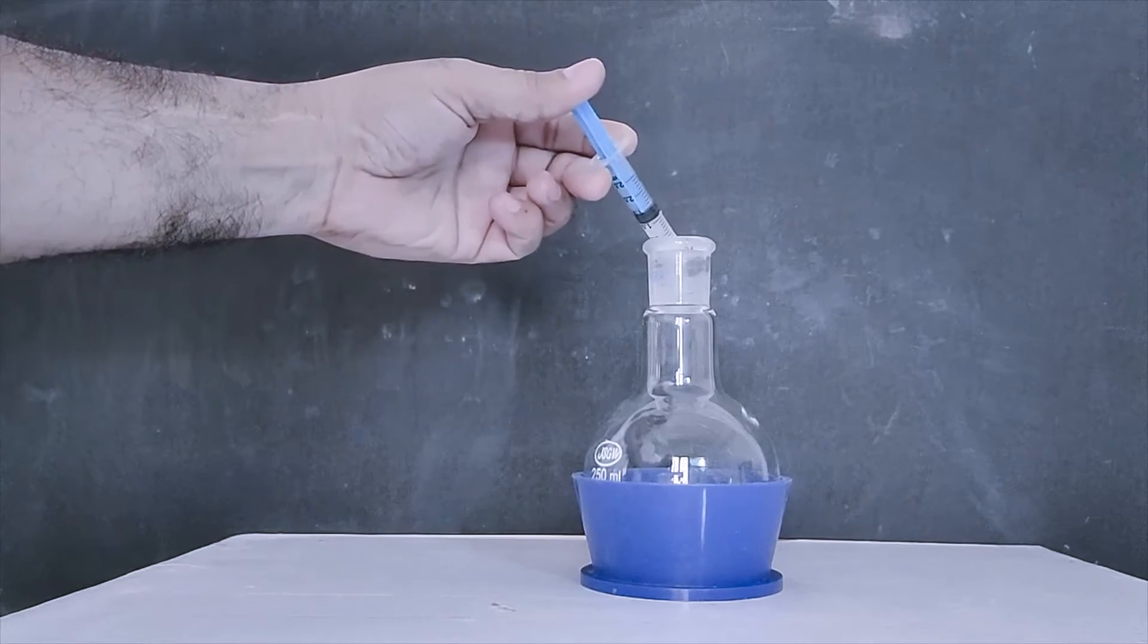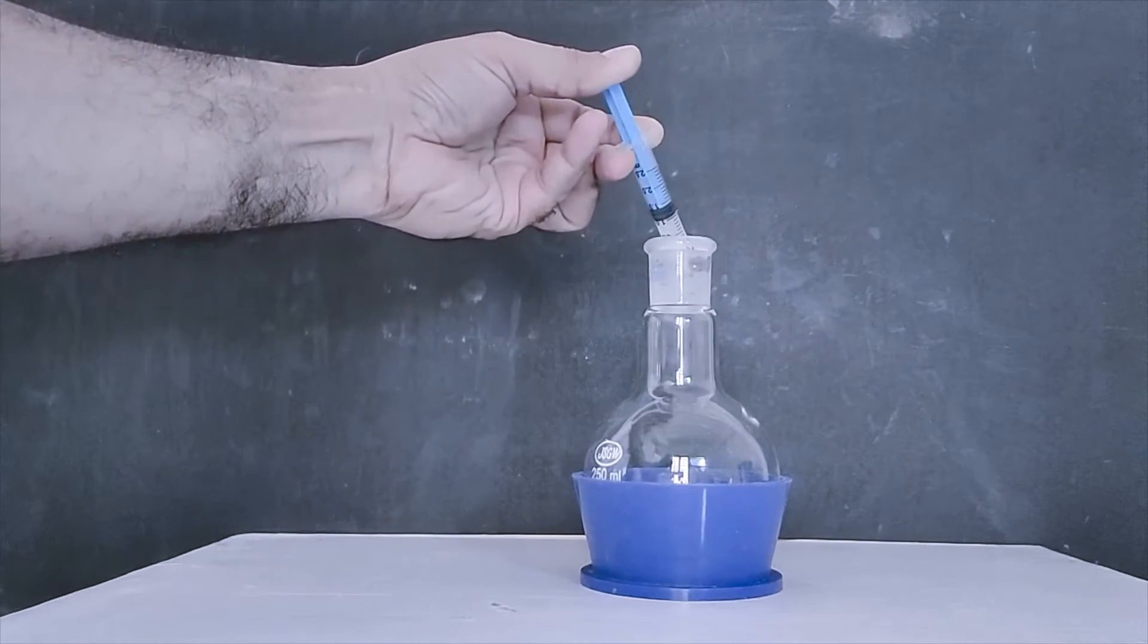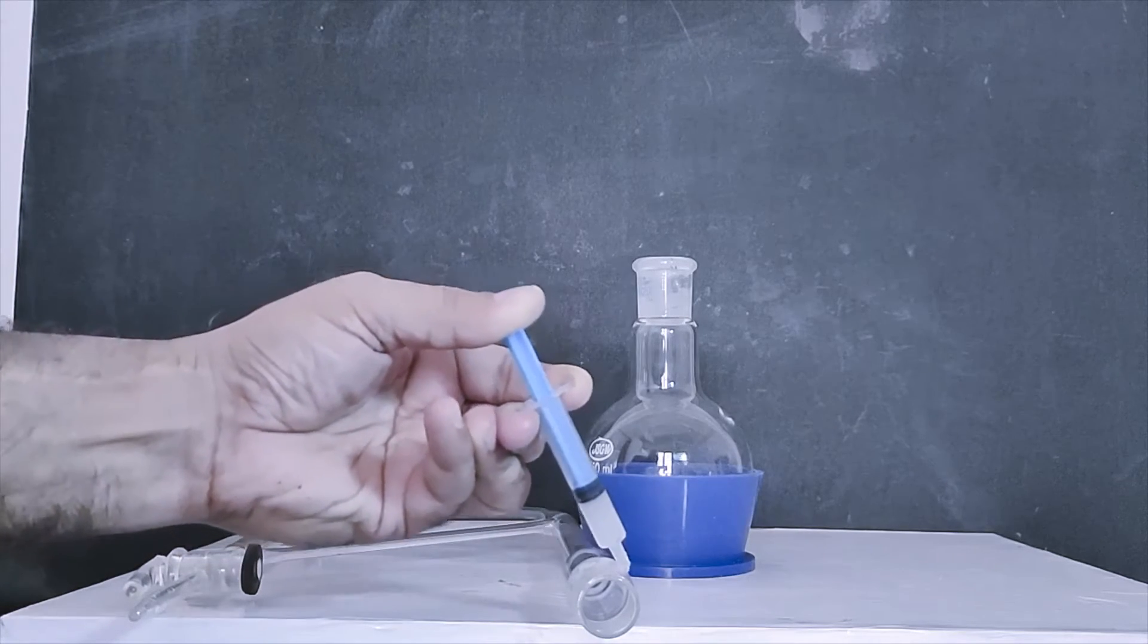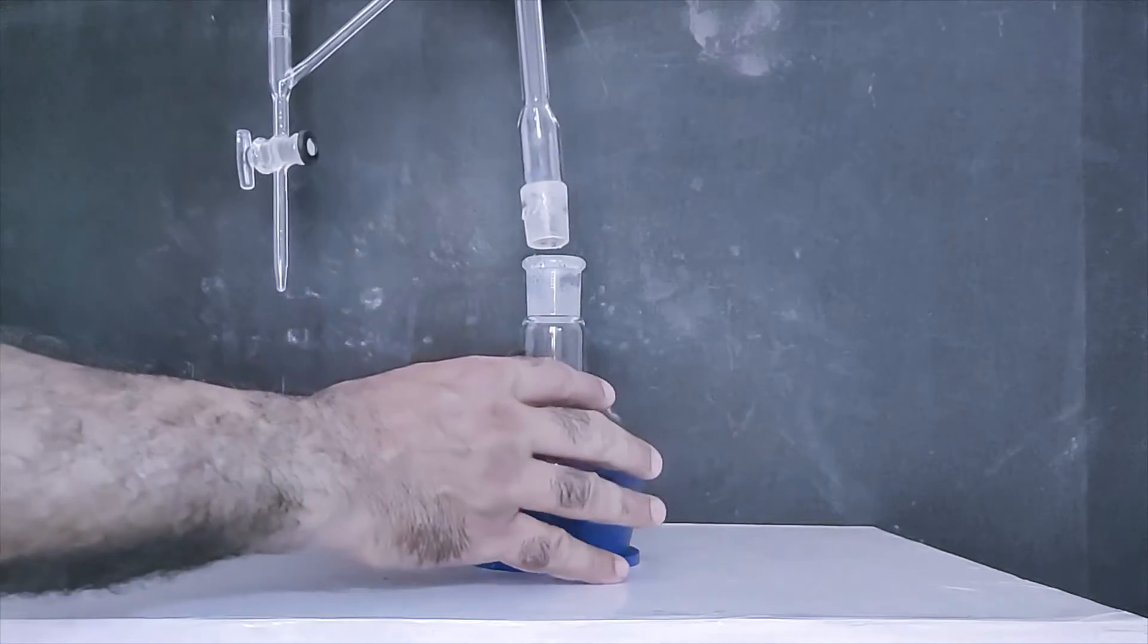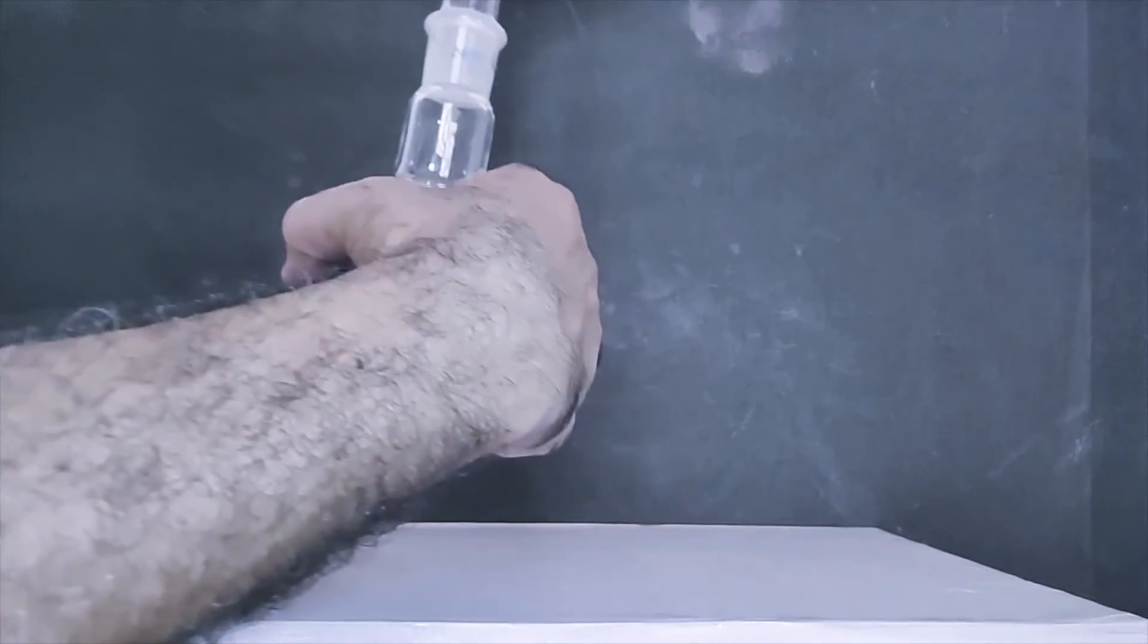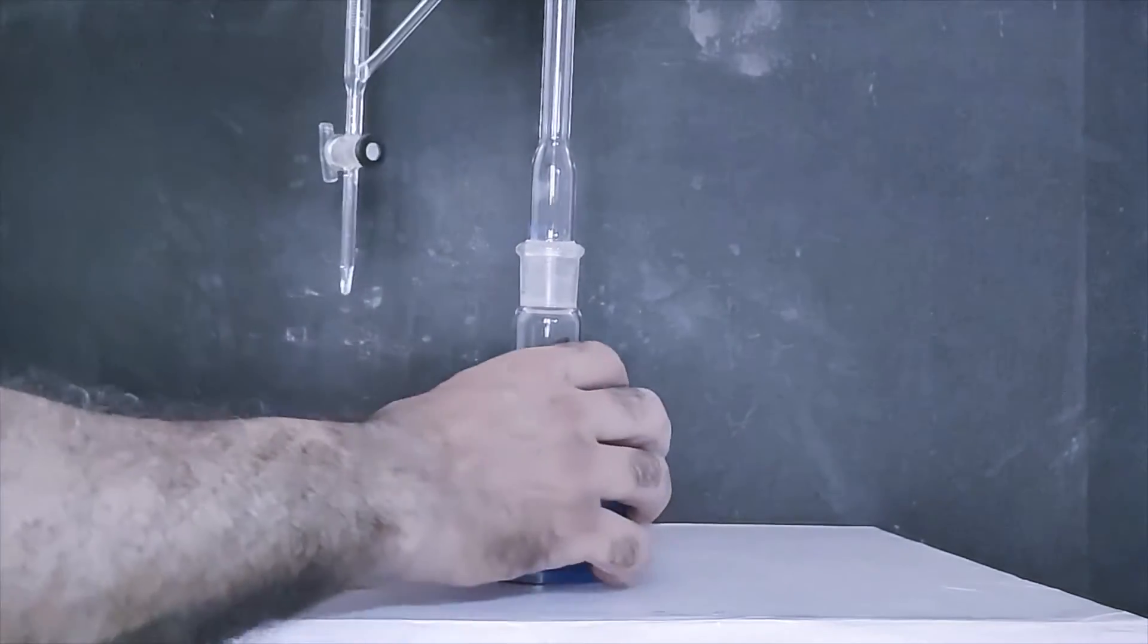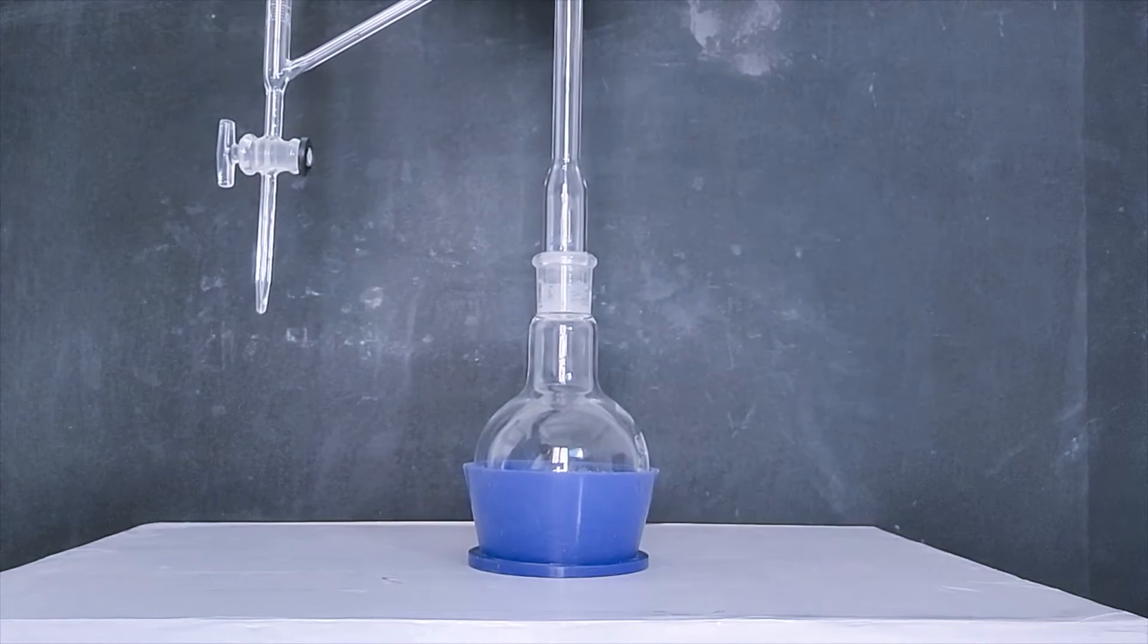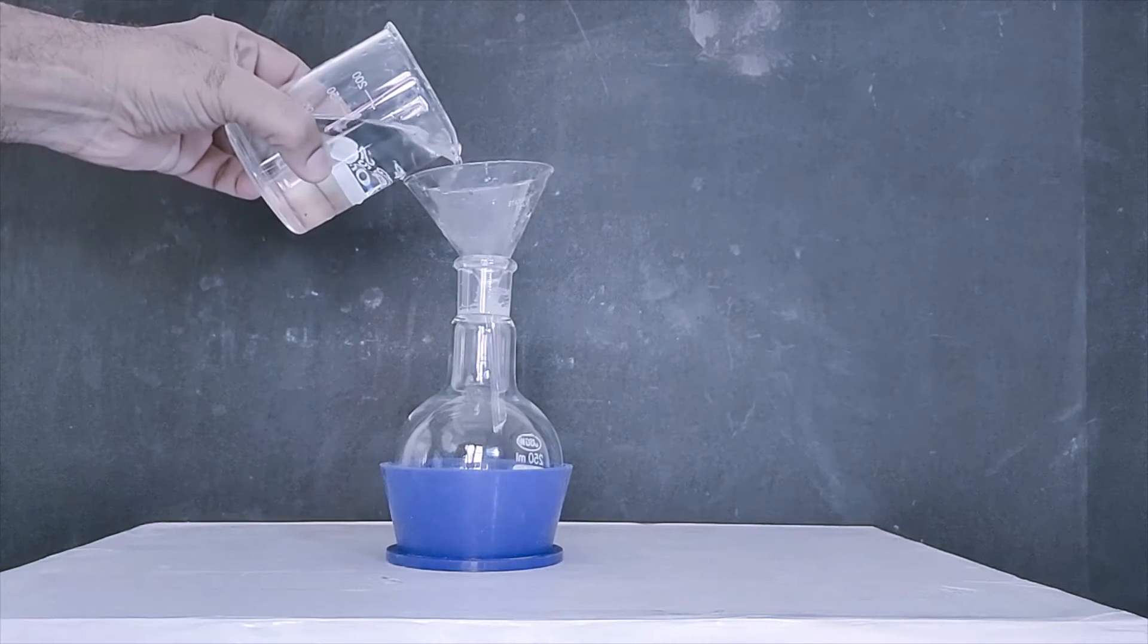Applying this lubricant at the joint. Adding 150 ml distilled water to it.